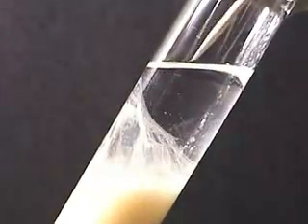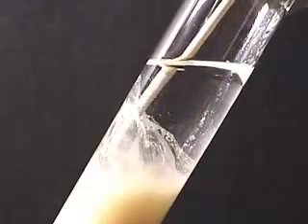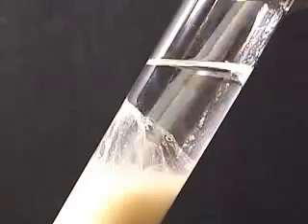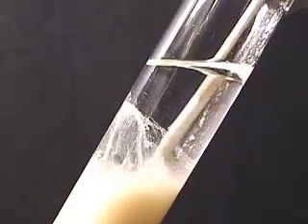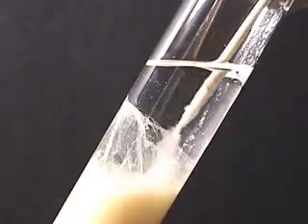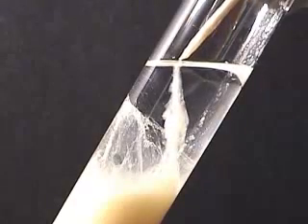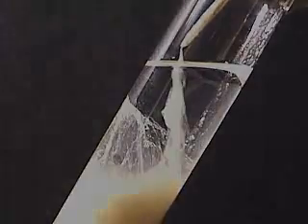The clear membrane visible here in the alcohol is DNA. Spool the DNA onto a long toothpick. This is DNA extracted from wheat germ. This completes the DNA extraction lab.